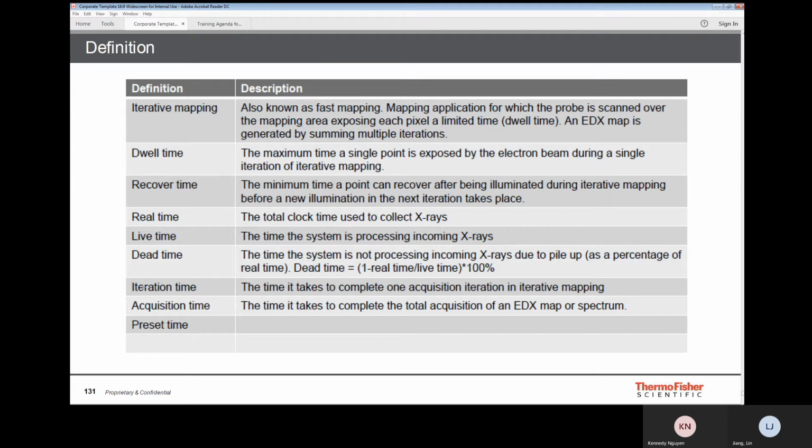If you have a large percentage of dead time, it means either your sample is blocking the detector, or the signal to the detector is blocked by the sample, or you get so much system noise.